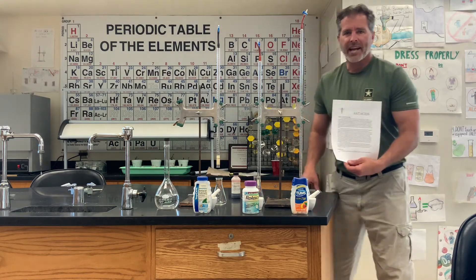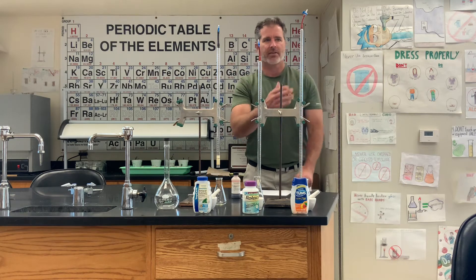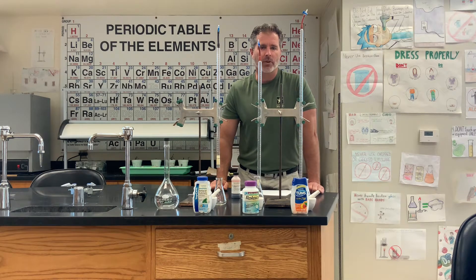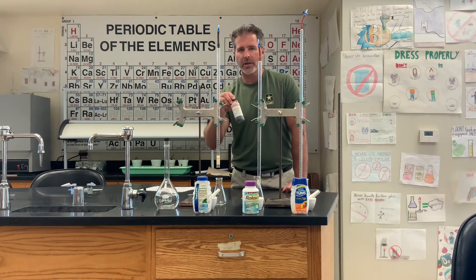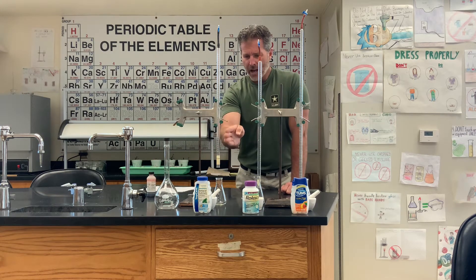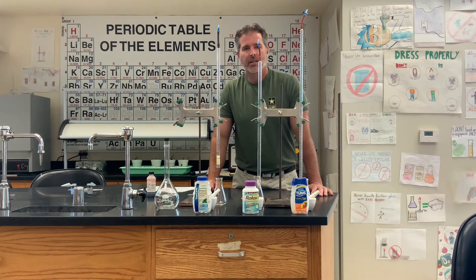Today we're going to be working on the antacid lab. I have three burettes that I will be using, and I'm going to fill those with 0.5 molar hydrochloric acid. We're going to do a titration using Congo Red Indicator, and we're going to be testing how much acid each one of these antacid tablets can neutralize.